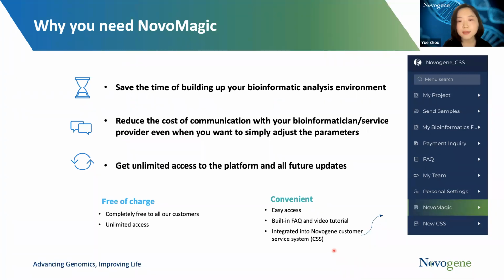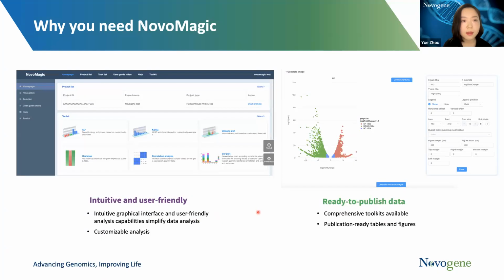Also, it's quite convenient to use the built-in FAQ and tutorial. Two of the highlights of the platform are the intuitive and user-friendly interface and the ready-to-publish data that can be generated from the platform. And here's how the interface looks, but I'm also going to show you a short demo at the end.